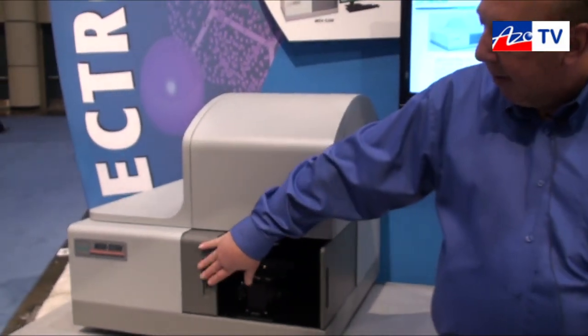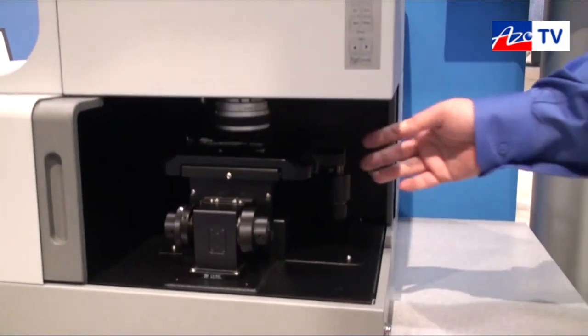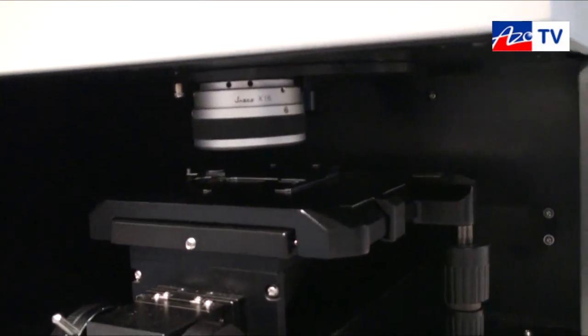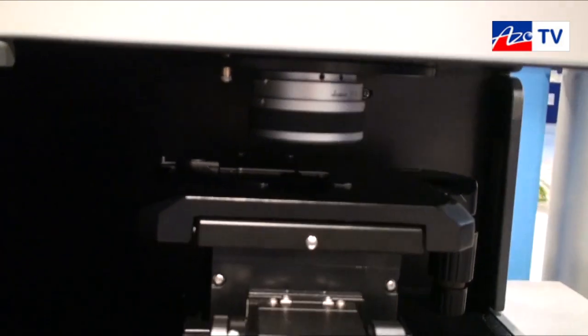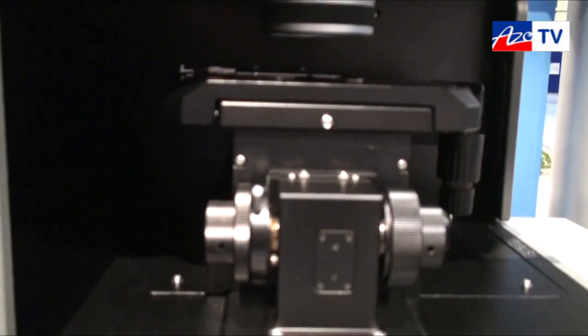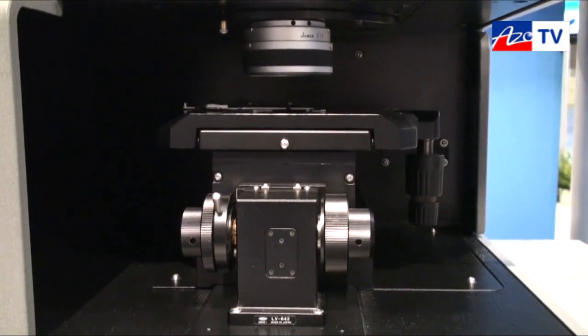The system is based on a scanning monochromator focused through a microscope system that uses all reflective optics. The Cassegrain system provides the ability to collect a wide range of spectra without changing objectives or having to worry about losing sensitivity from a refractive objective. The system also has the ability to do high resolution from a 10 nanometer slit width all the way down to 0.1.